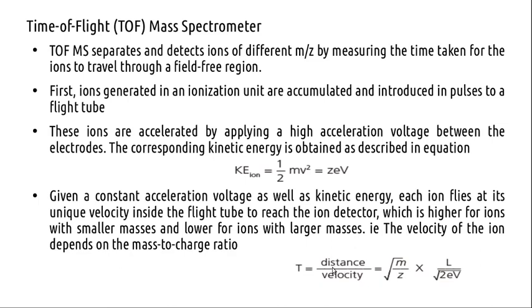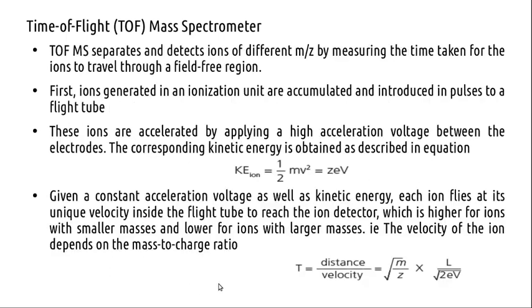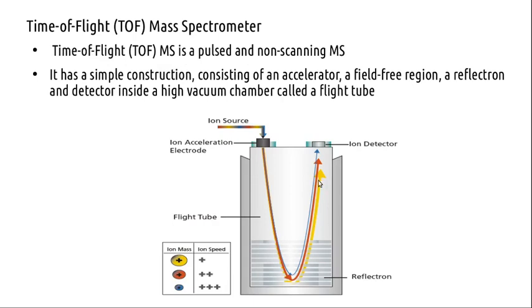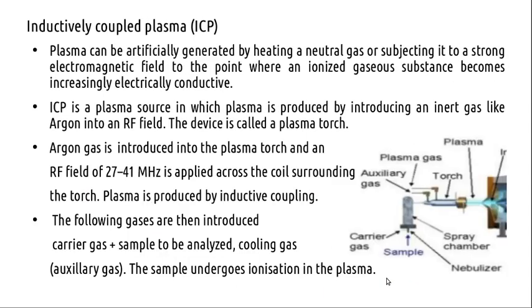On the basis of that you will be able to detect the ions. Since this distance is a fixed distance, we will be able to separate the various constituents depending upon their time of flight.